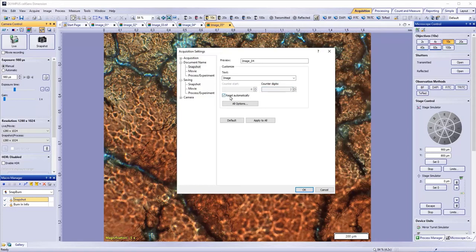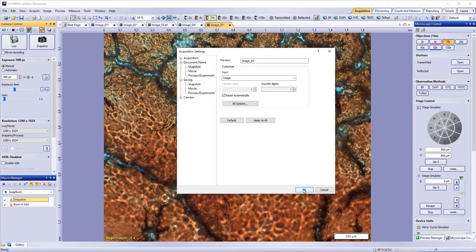If you deleted an image within the range of images that are open, it will assign the next snap to the first available number.